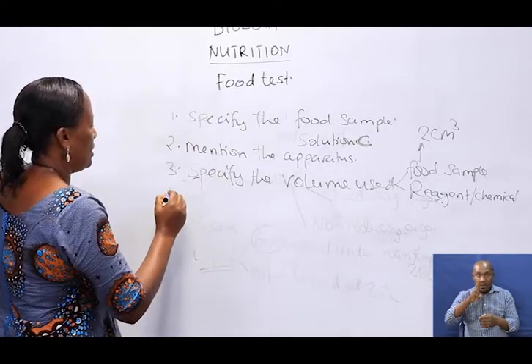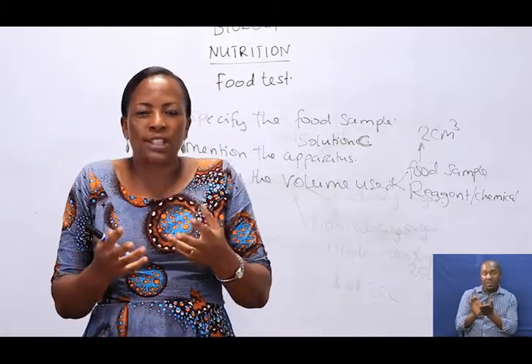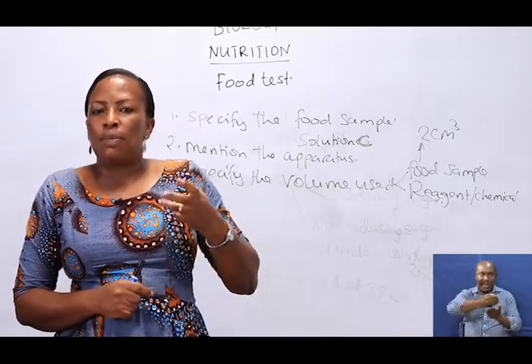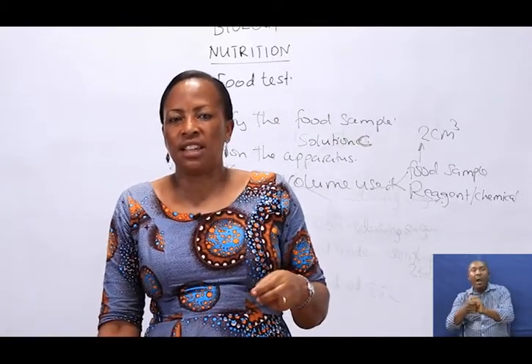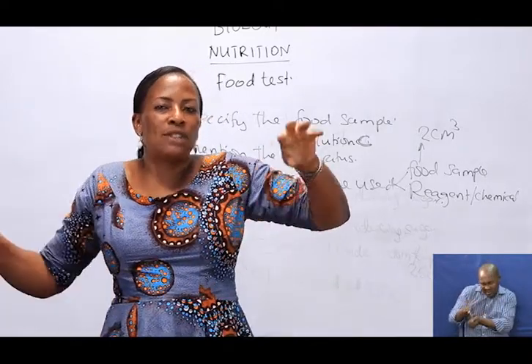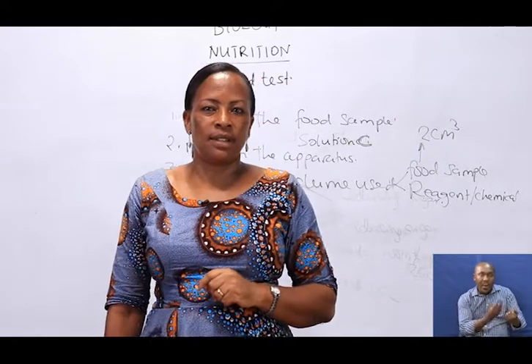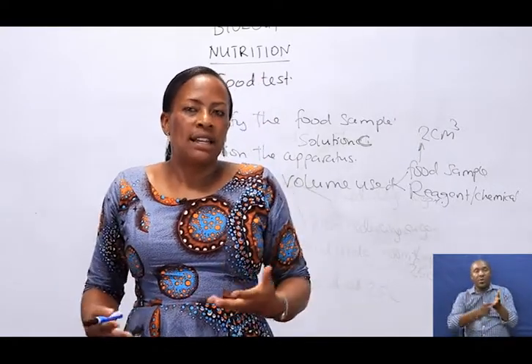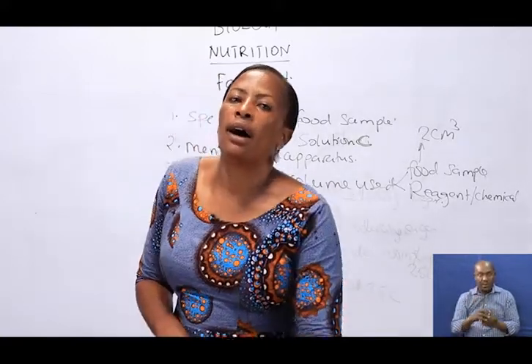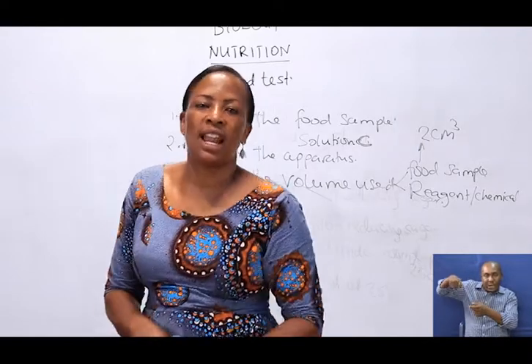Another thing is to specify the correct procedure. Remember to mention the correct procedure. If the procedure is accompanied with shaking, make sure that you write shaking. And if the procedure involves boiling, make sure that the word boiling appears in your report. And if the procedure needs you to shake the material, make sure that you allow it to settle as per instruction. Allow it to settle for some time.